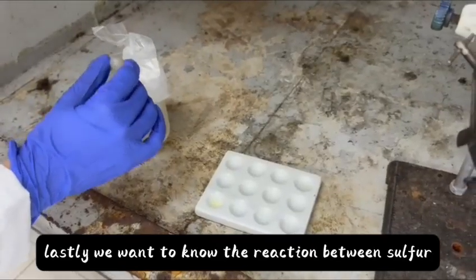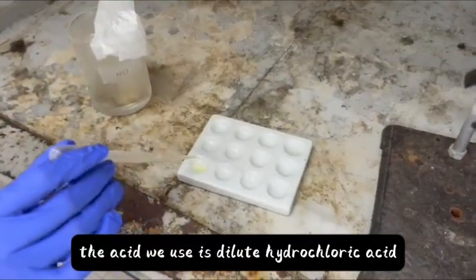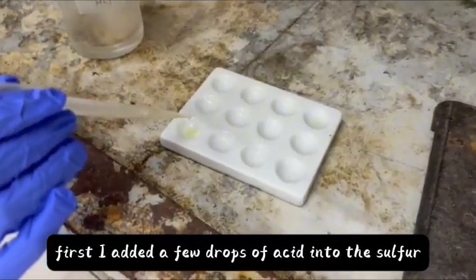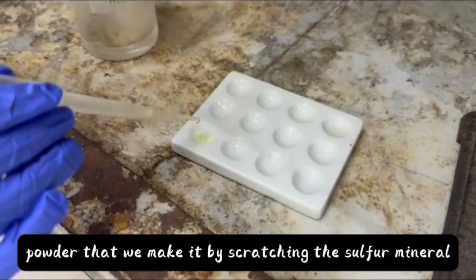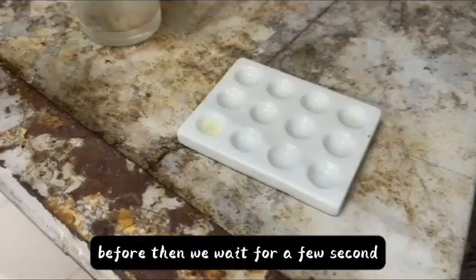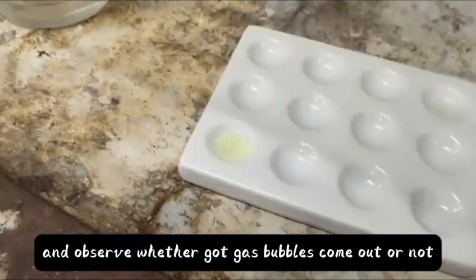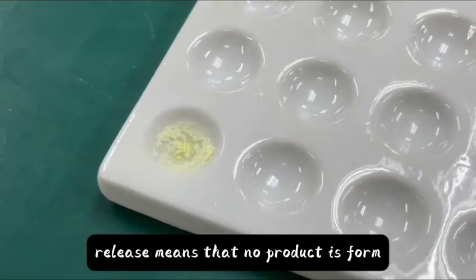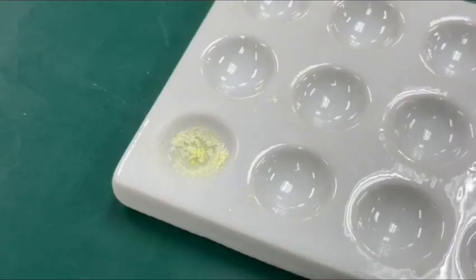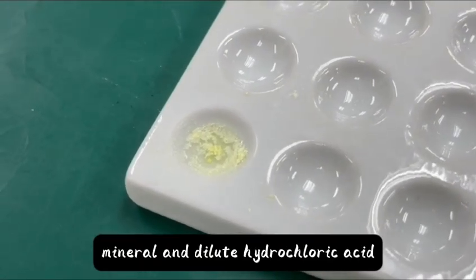Lastly, we want to know the reaction between sulfur mineral and acid. The acid we use is dilute hydrochloric acid. First, I added a few drops of acid onto the sulfur powder that we made by scratching the sulfur mineral before. Then we wait a few seconds and observe whether any gas bubbles come out or not. As we can see, there are no bubbles released, which means that no product is formed. There's no reaction between sulfur mineral and dilute hydrochloric acid.